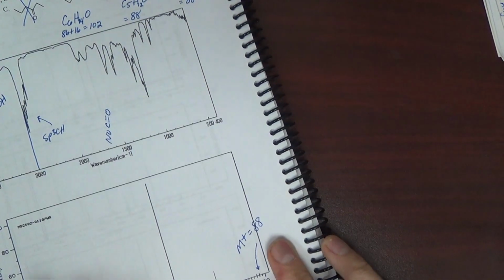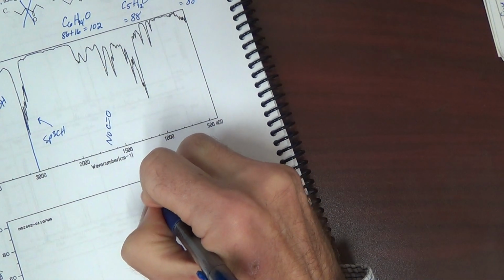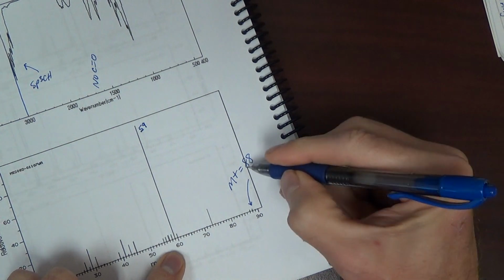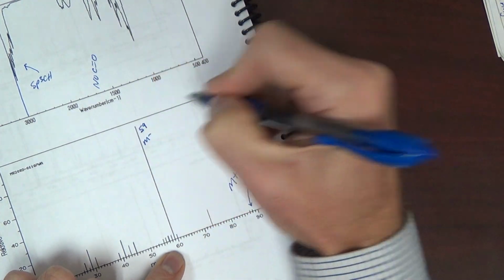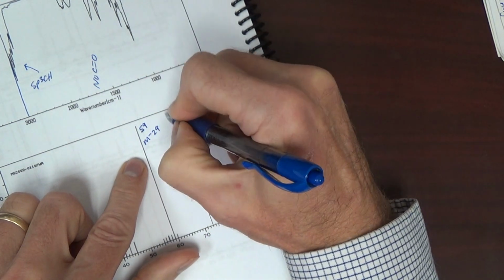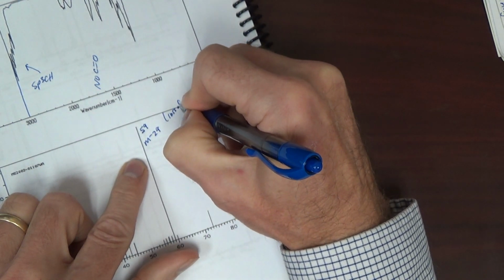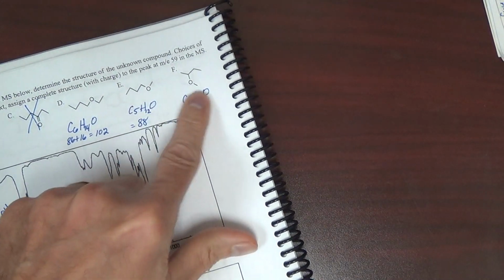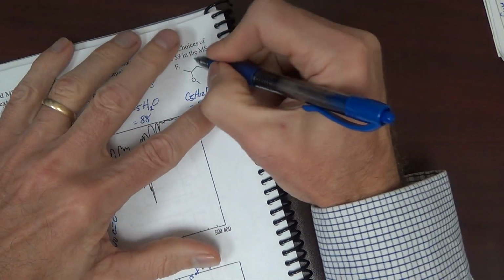Let's look at here. We got a peak at 59. The mass is 88. This is M minus 29, which is loss of an ethyl group, ethyl radical. Between these two here, which is most likely to lose an ethyl? It would be this one.